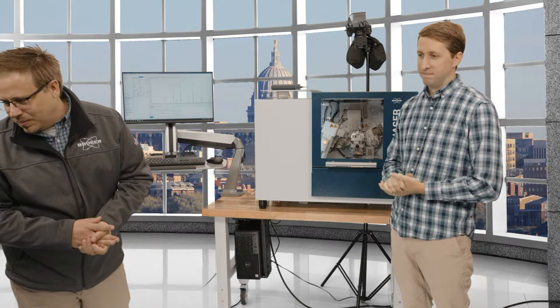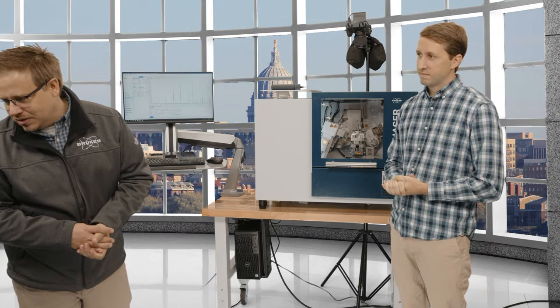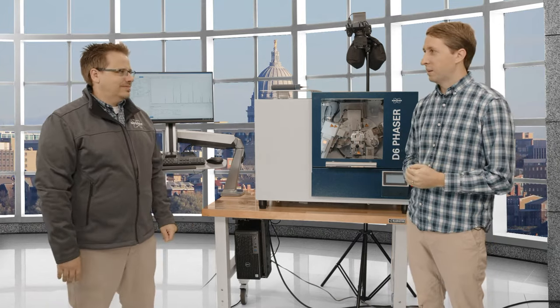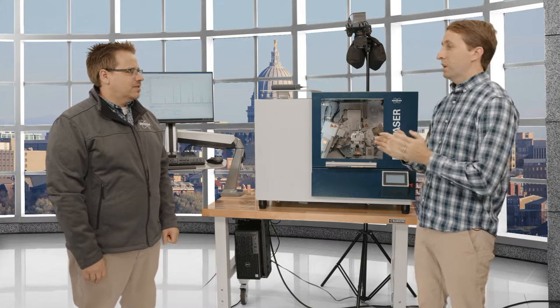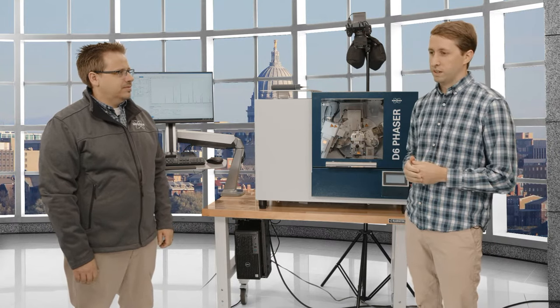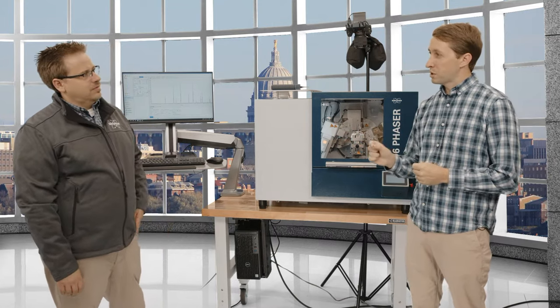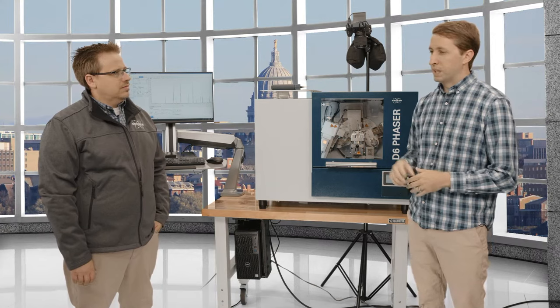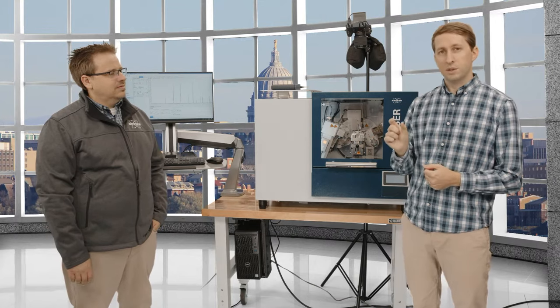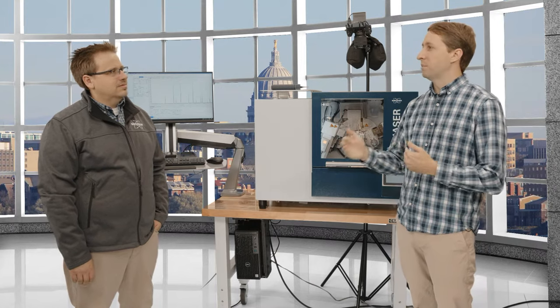All right, next question, Mike Fallon. If the X-ray source and detector are close to the sample stage to increase signal to noise, do you lose peak resolution? You will lose a little bit of resolution. And again, that's instrument resolution. Yes. Right, when we look at a peak profile, there's really two components that are contributing to the resolution. There's the instrument, which has to do with the radius, the slits, and so on. And then there's also the sample. So you will lose a little bit of instrument resolution by having a smaller radius, but it's really not a lot, right? In most cases, most real world samples, the broadening that you see in those peak shapes is usually coming from the sample or sample-related convolutions and not dominated by the instrument.